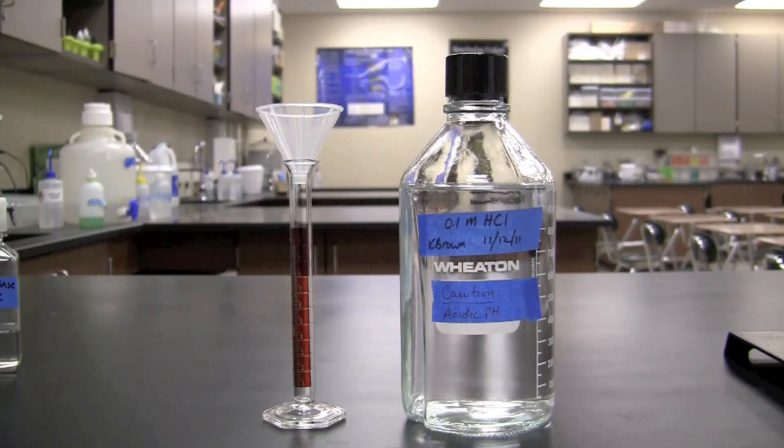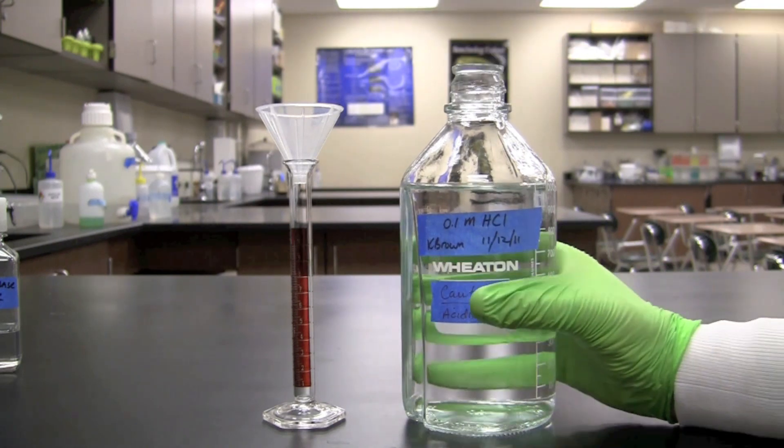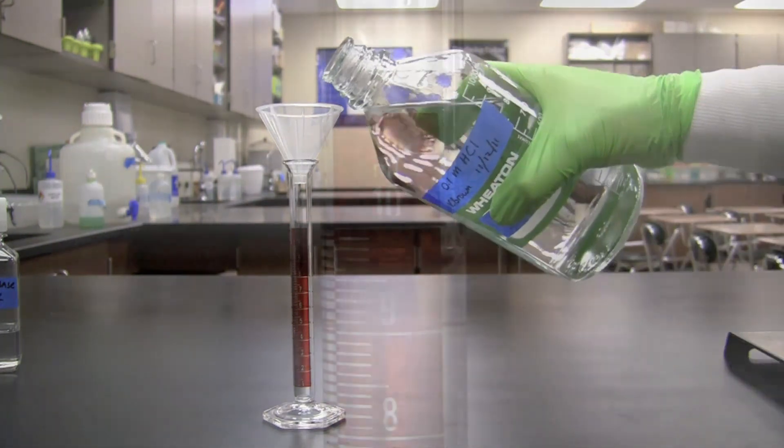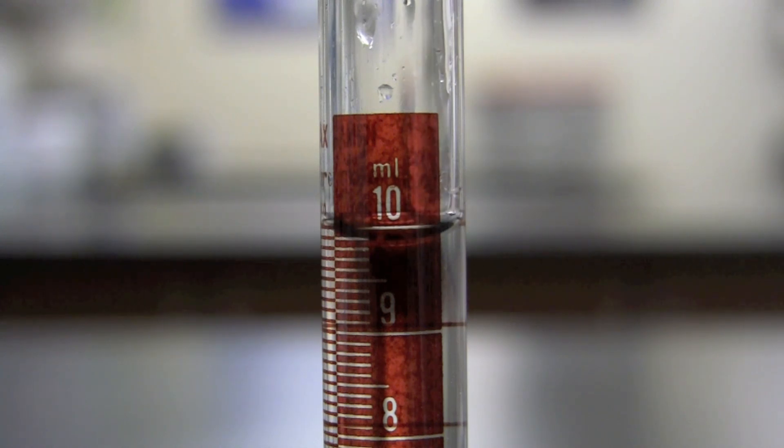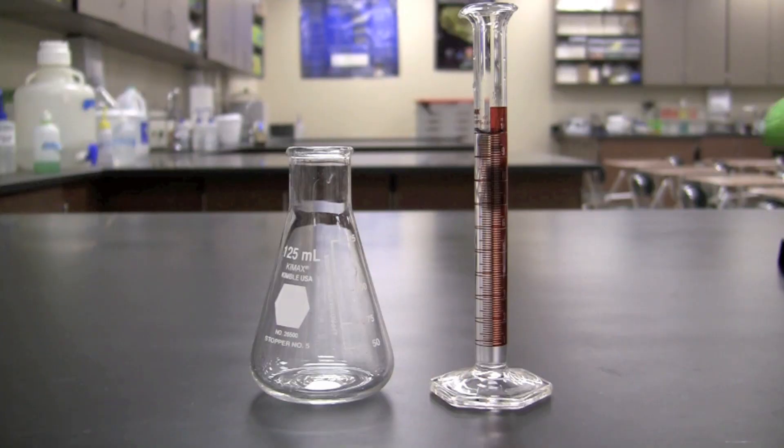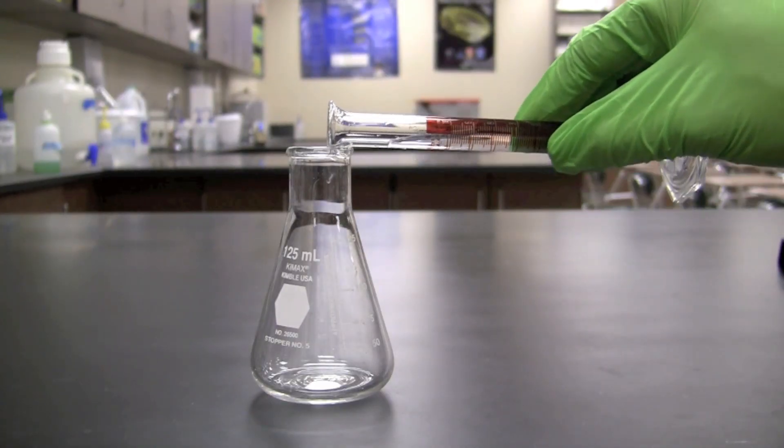Next, measure 10 milliliters of 0.1 molar hydrochloric acid using a graduated cylinder. Pour the 10 milliliters of hydrochloric acid into a flask.